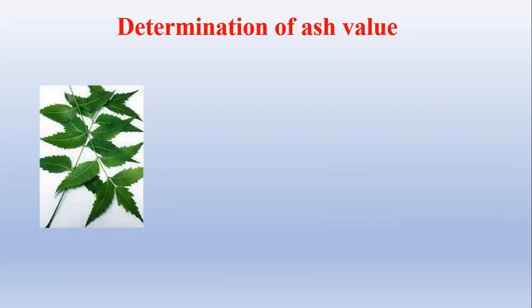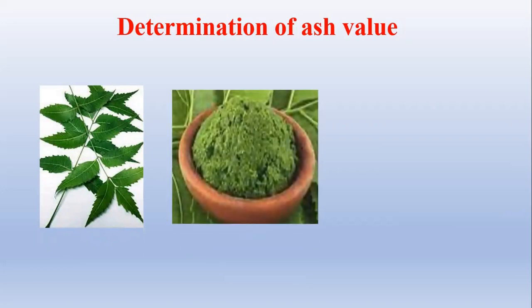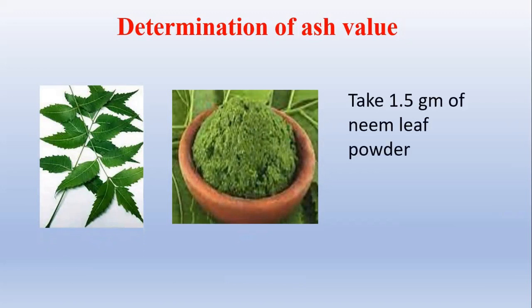So here we have to take neem leaves, dry these neem leaves, and then the neem leaves powder should be taken. We have to take 1.5 grams of the neem leaves powder in a tared crucible.